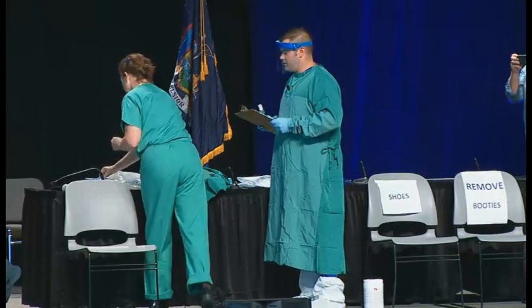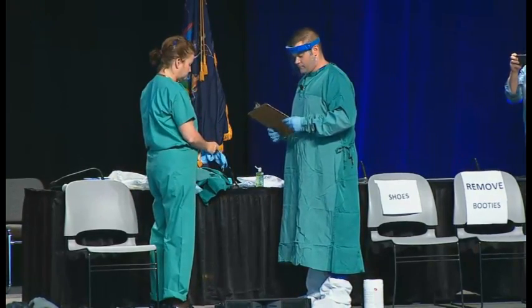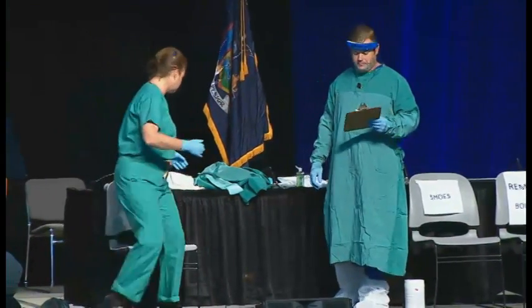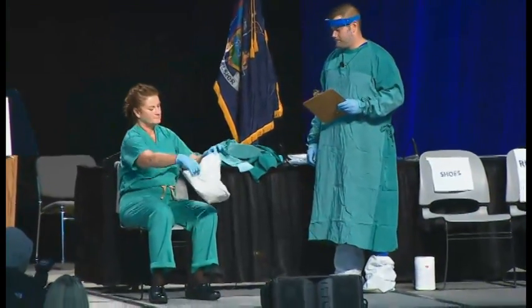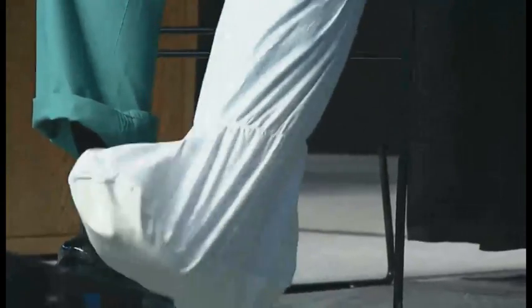First, she's going to put on a pair of the nitrile gloves. Next, she's going to sit down in a clean chair and put on shoe covers and pull them up to her mid-calf. One of the things that's key with the alcohol-based hand rubs is that it needs to dry. When you put it on your hands, don't rush. Don't start putting on your gloves before it's dry. Let it dry fully before you proceed to the next step.